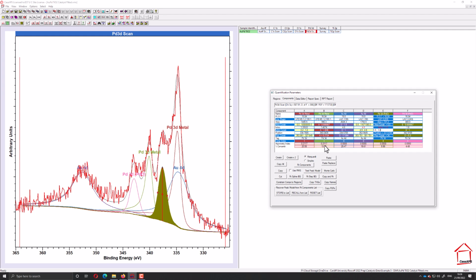Palladium oxide is one of these materials which has some satellite structure just like the metal does. But as we're doing for the metal here, we can actually ignore those small satellites because, with such low levels of these metals, they're going to quantify to 0, or if we want to be more accurate, something like 0.001 or something equally as crazy. So let me just highlight the colors here so we can see them named.